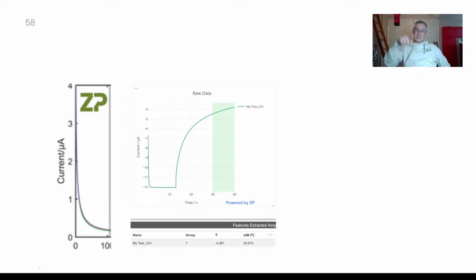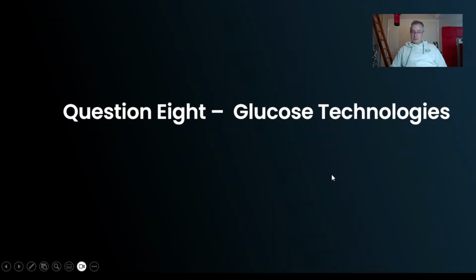But I'm expecting your data to come down like this, when in fact your data does this, which confused me. But scan the QR code for amperometry, set your data for 90 seconds if you want. But the potential that you're meant to be applying is 650 millivolts, then send that to me. And that will really help me figure out what's going on here.